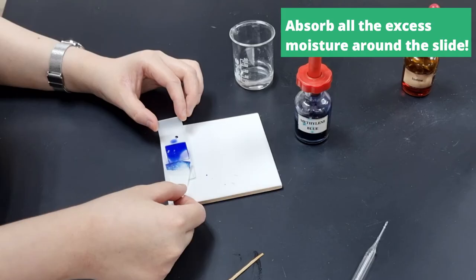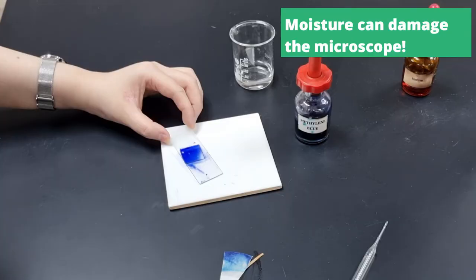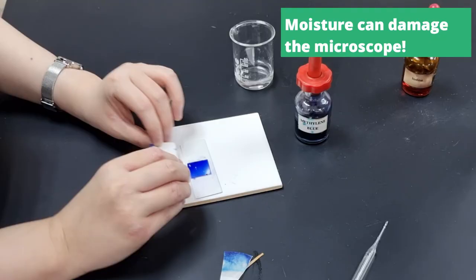So if one filter paper is not enough, use another and just mop up all the excess methylene blue solution around it. You really don't want the slide to be wet when you put it under the microscope. So make sure it's dry on these sides, mop up all the extra, and then it's pretty much ready.